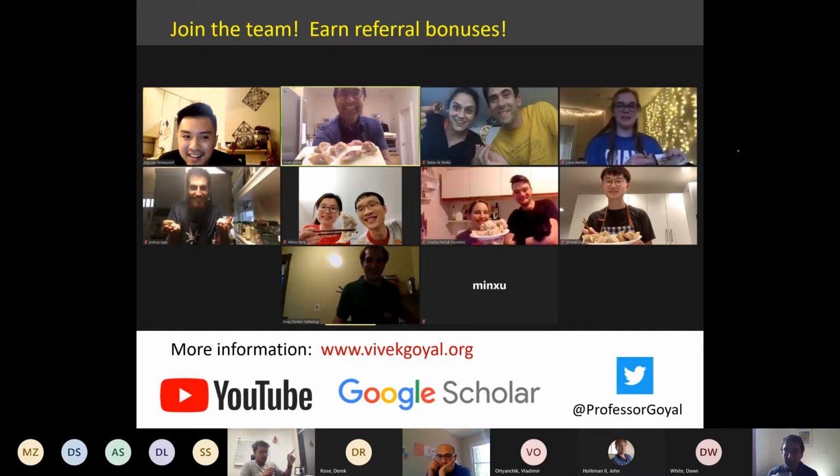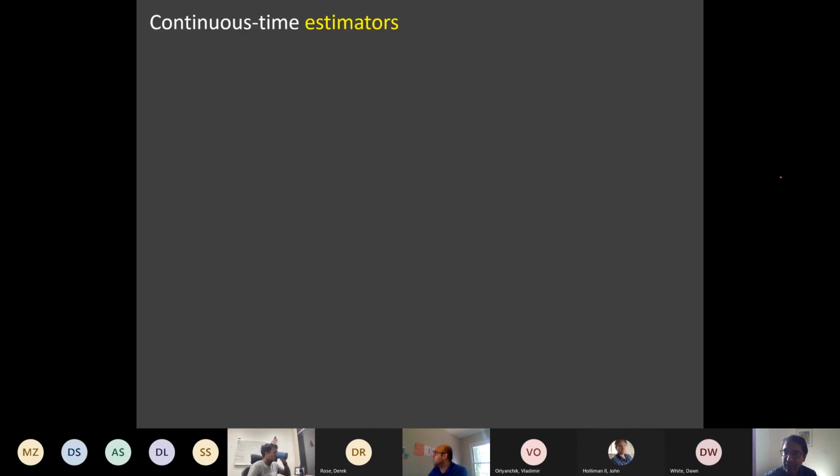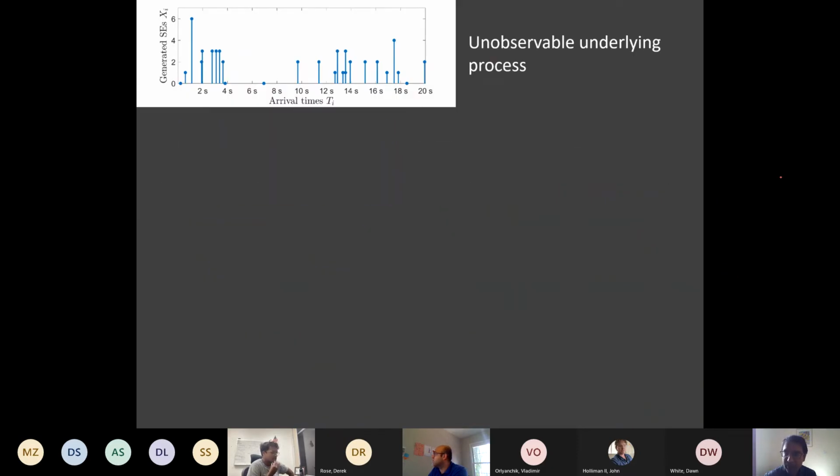Okay, great. And one follow-up, and I have a question after that. You mentioned this and I probably missed it: you need to have some estimator for the number of incident ions, right? Is that something you derive from the beam current? Is there some heuristic that we can use? So I'm getting that number of incident ions from kind of burst counting. Obviously, with anything like this, I had various versions of these illustrations, and maybe there's a different version that I should have emphasized. But let me just go all the way back to my first illustration. I think it's worth it.